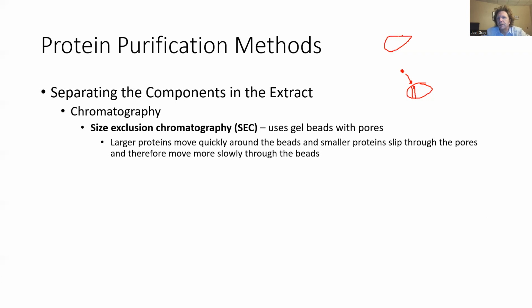A large protein, on the other hand, is going to see that opening where that channel is, and it's like if you imagine you were shooting a regulation size basketball on a kid size basketball hoop. Well, you'd shoot that regulation size basketball in that kid's hoop, and it would hit the rim and not go anywhere. It wouldn't migrate through. So it would rim out. So it would hit and then go to the side.